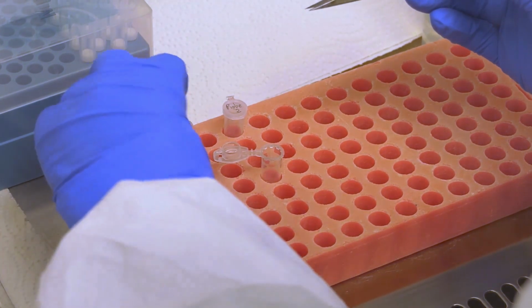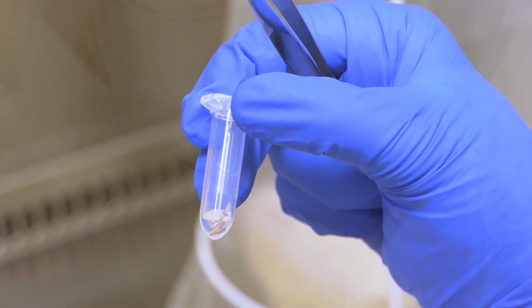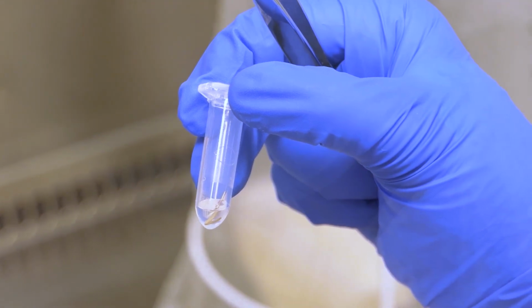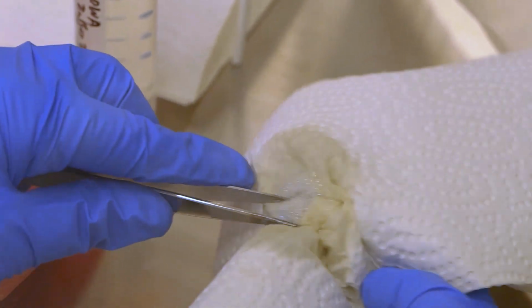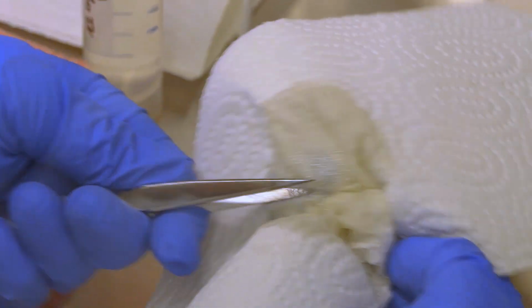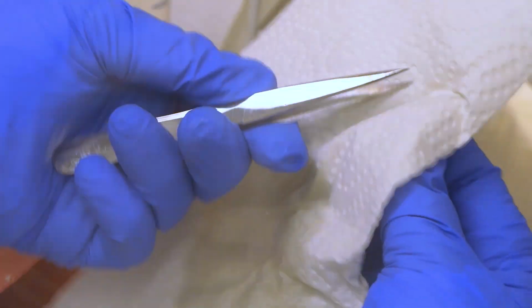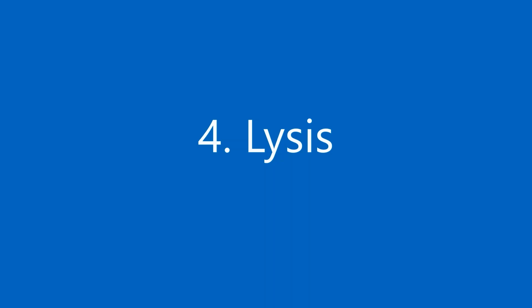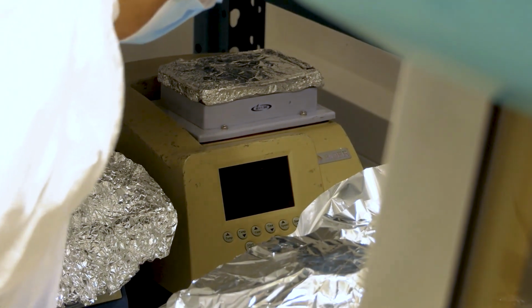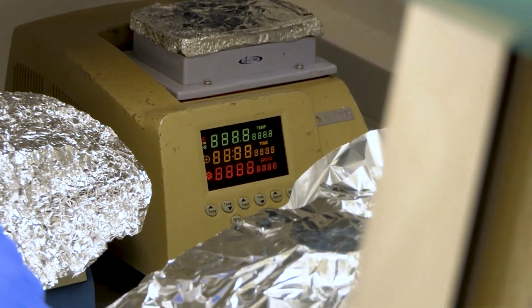The leg should be mostly covered by the lysis buffer, but don't use too much, as this will force you to use much more of the other chemicals later on as well. Remember to always clean tools after each individual sample and after the last sample too, otherwise you may find sequences of previous projects in your libraries later on. Lysis is carried out at 56 degrees overnight to ensure that all tissue is degraded.